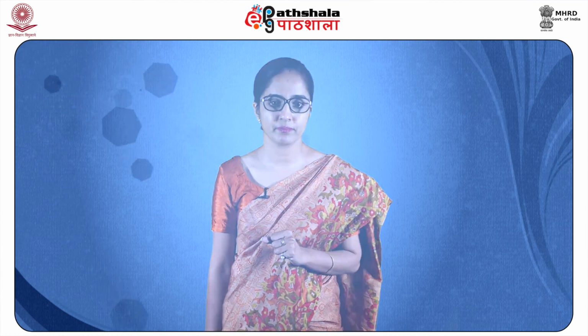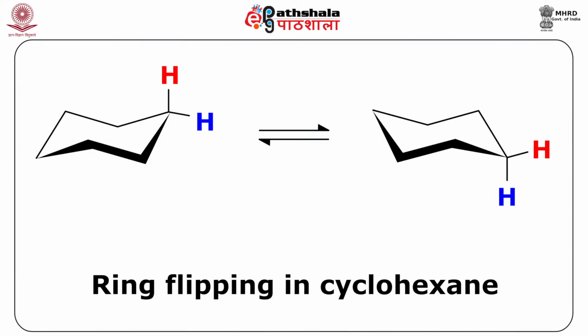The single peak observed has a chemical shift in between the actual chemical shifts of the axial and the equatorial protons. The rate of ring flipping can be slowed down by decreasing the temperature. If we cool this sample of cyclohexane to -100 degrees Celsius, ring flipping occurs at a very slow rate, and thus separate signals are observed for both axial and equatorial protons.